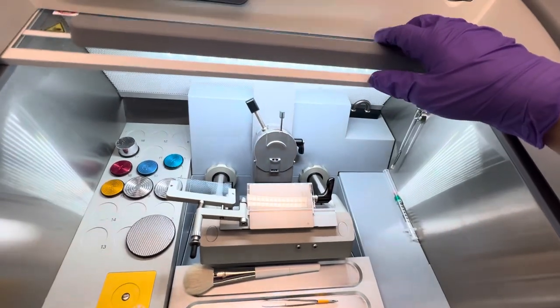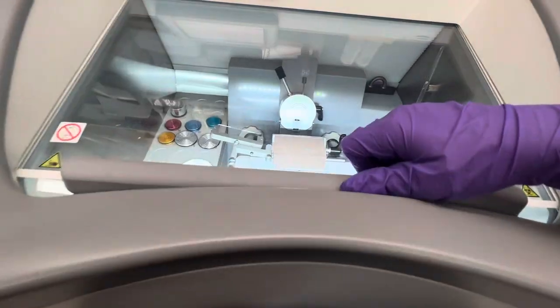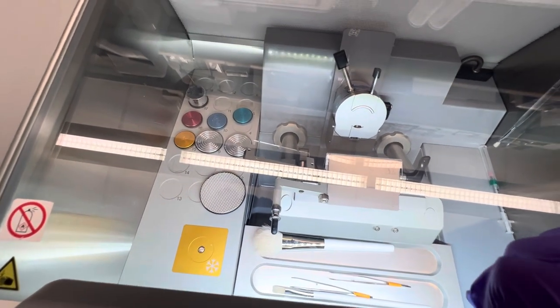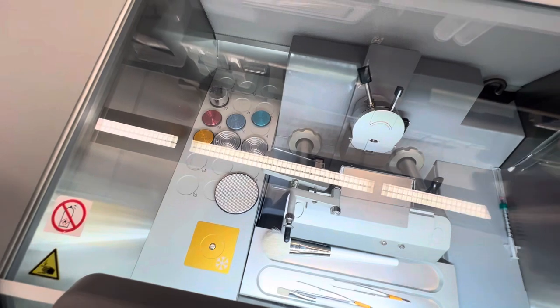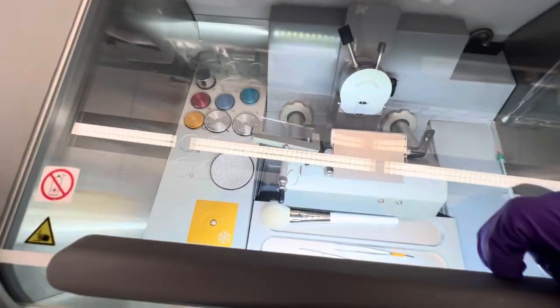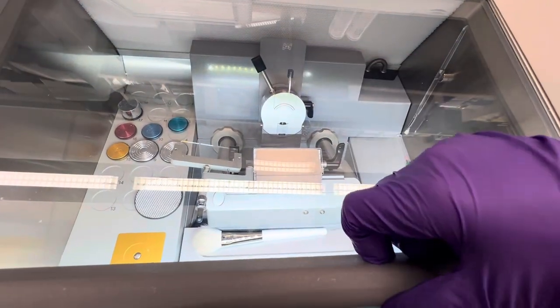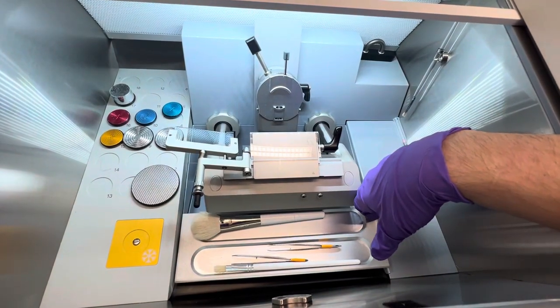Yeah. And again, anytime you're not using it or you step away, also be sure to close the window. Whenever you're freezing the block, you want to make sure you close the window, because if you have it open for too long, especially when you walk away, it can warm up and your OCT block will start melting, and that'll just mess everything up. And that is not what we want. So again, keep the window closed whenever you're not using it. Otherwise, it can get pretty cold in here. Just be careful with your hands.